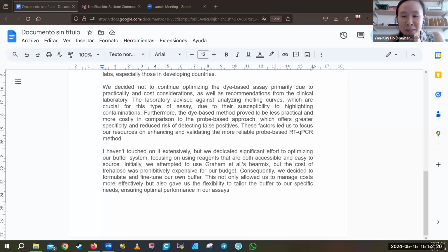Oh, that's amazing. That's very cheap to make your own transilluminator. I remember I was trying to cut out a cardboard box just to cover things. So it's definitely a scale up from that, but also very affordable. Initially I made one complete box, and then I realized, what if I want to cut the gel? Then I have to make it open and still leave the transilluminator inside.